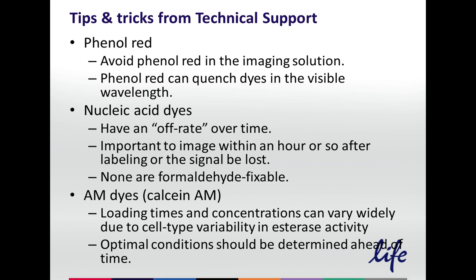So for AM dyes, your loading times and concentrations can vary very widely. Oftentimes when you're looking at our product information sheets, we'll give you a range of concentrations and times to try, but remember that cells that are acutely isolated from animals often take a little bit longer, whereas cells growing in culture can take a little less time. And always do your own empirical optimization of loading to ensure that you're getting the absolute best signal.